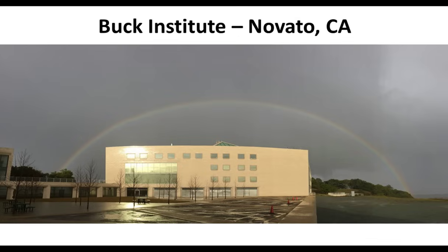Thank you, Dr. Stokes and Dr. Schilling. We have time for one more question from our viewer. If you compare AB-enriched samples versus label-free acquisitions of non-enriched samples, do you see modified peptides that escape the enrichment due to PTM context not being optimal for AB detection? And if so, how do you deal with such biases?